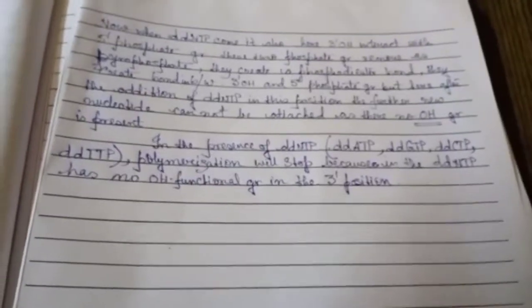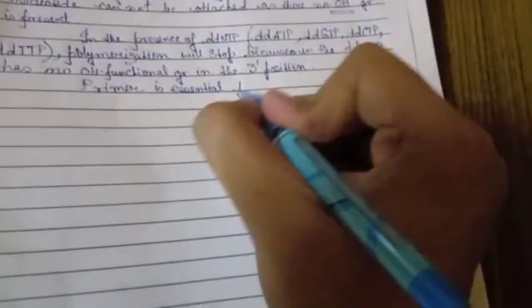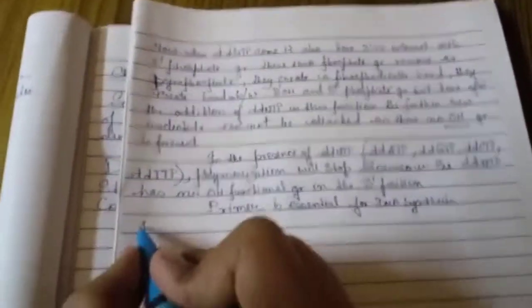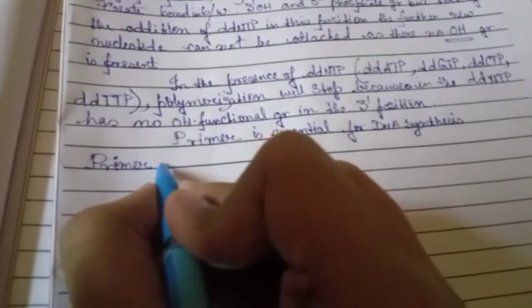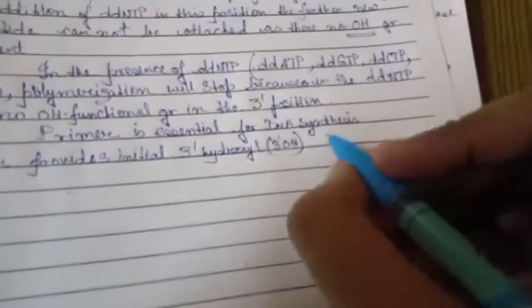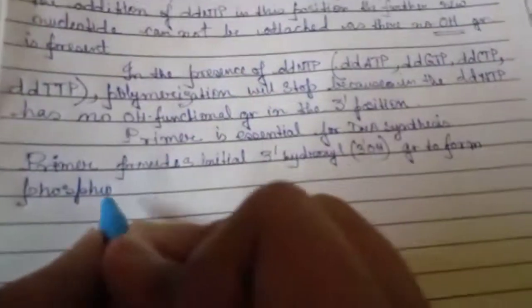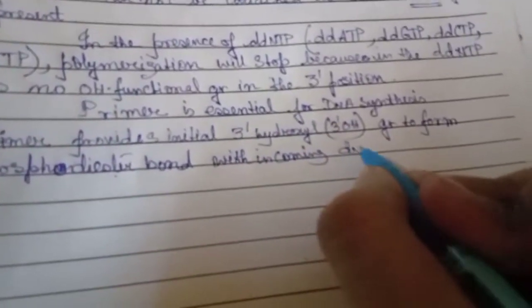When ddNTP is added in a DNA synthesis reaction, the synthesis terminates with the incorporation of ddNTP or dideoxyribonucleotide. So this reaction is also called the chain terminating method. And here ddNTPs are also known as chain terminating nucleotides.